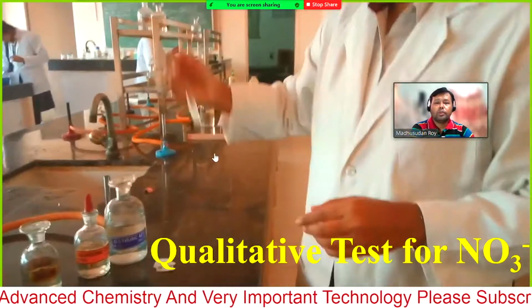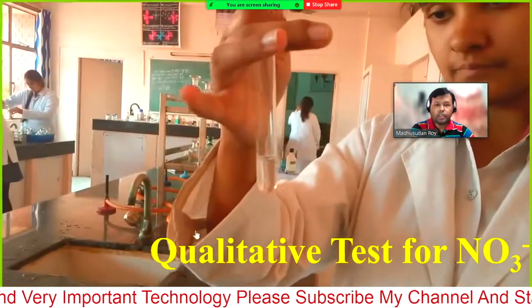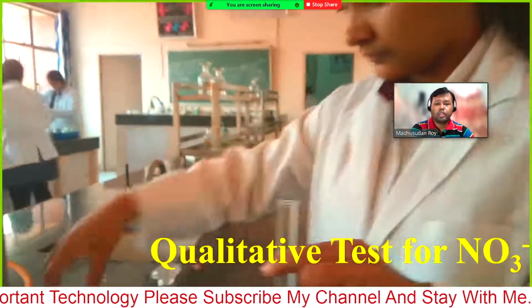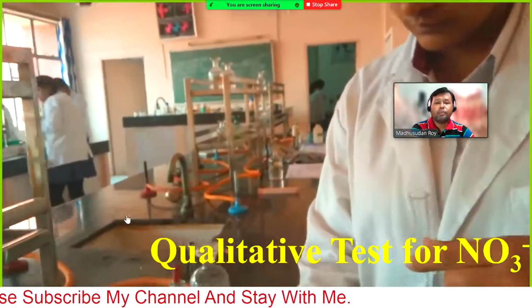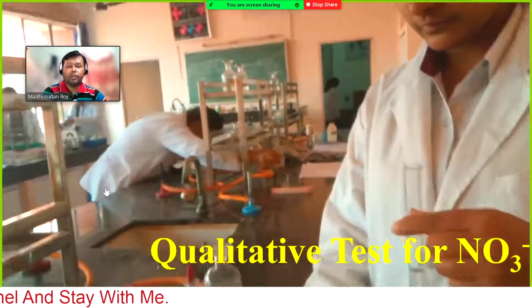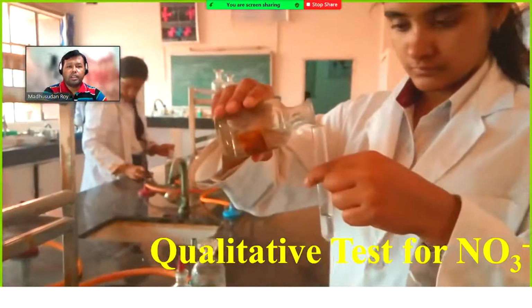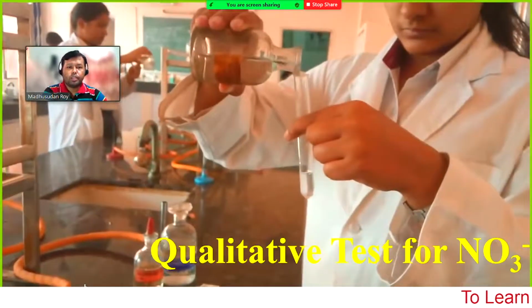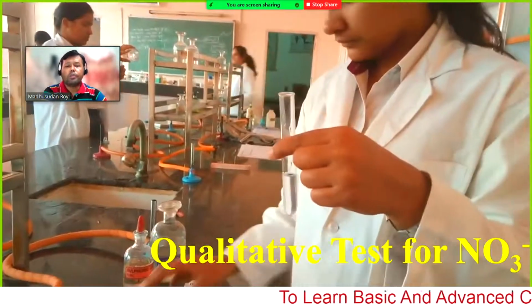Okay, now dissolving the salt in the test tube, this looks clear. Now adding freshly prepared iron 2 sulfate. Here you can see this is the freshly prepared iron 2 sulfate, in almost equal volume.